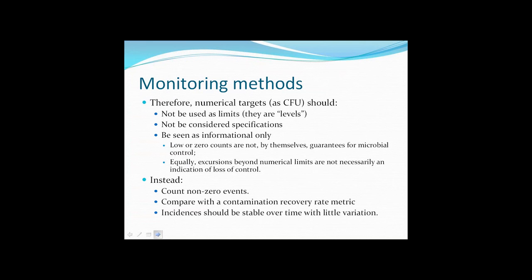So following on from this, the USP then says, well, if these methods are inaccurate and limited, then the very nature of the alert and action level concept needs to be called into question. It's really saying that alert and action levels have evolved without sufficient consideration given to the inaccuracies in the methods used to detect microbial numbers.